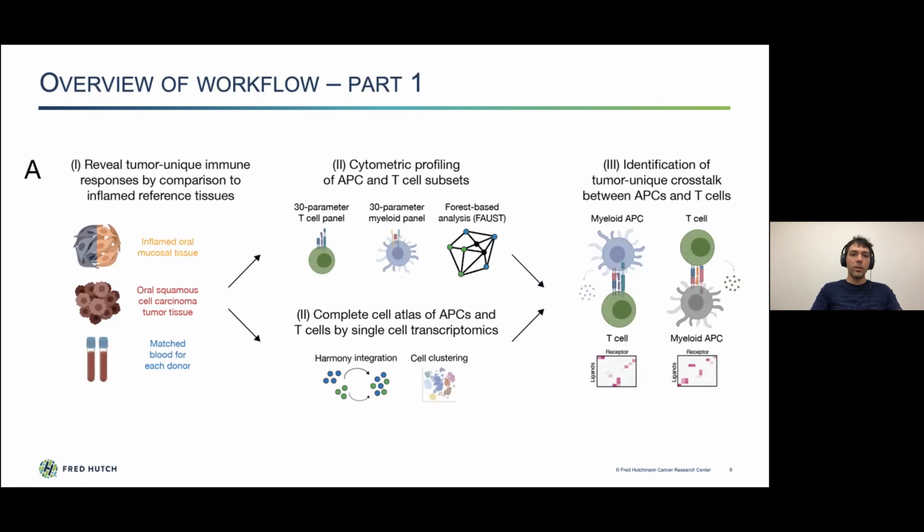Then we were collecting oral squamous cell carcinoma tumor tissue from patients that were undergoing surgical resections of their tumors. That is, of course, not the very same patients, but it's the same tissue site. And for both of these tissue cohorts, we were collecting matched blood for each donor. And then we pursued two parallel single-cell analysis approaches.